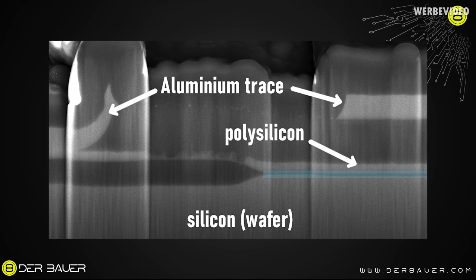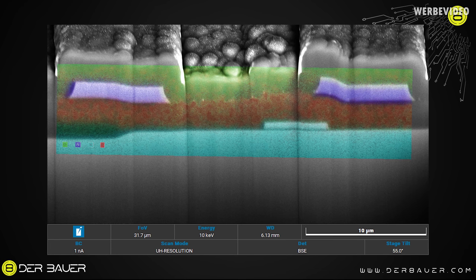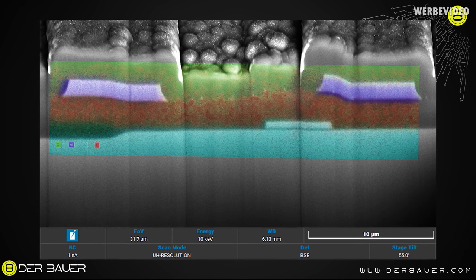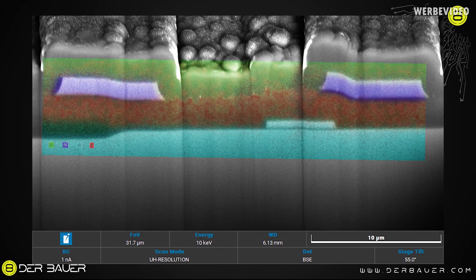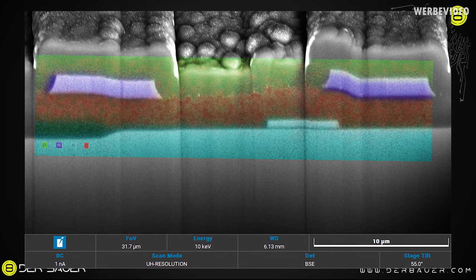If you're wondering how we know which material we're looking at in a cross-section, that's due to the EDX process. Basically, you shoot electrons onto a chemical element and it emits X-ray radiation that is very specific for every element. So shooting your electron beam on phosphorus or silicon, they will emit a very specific radiation, and this way you can detect which element is at which position. This way we can tell that violet elements are traces made out of aluminum, green colored areas contain a lot of oxygen — probably some kind of insulating layer such as the dark green silicon dioxide underneath. The very thick teal layer on the bottom is the silicon wafer itself, and a very tiny teal layer in between would be the polysilicon of the transistor gate.